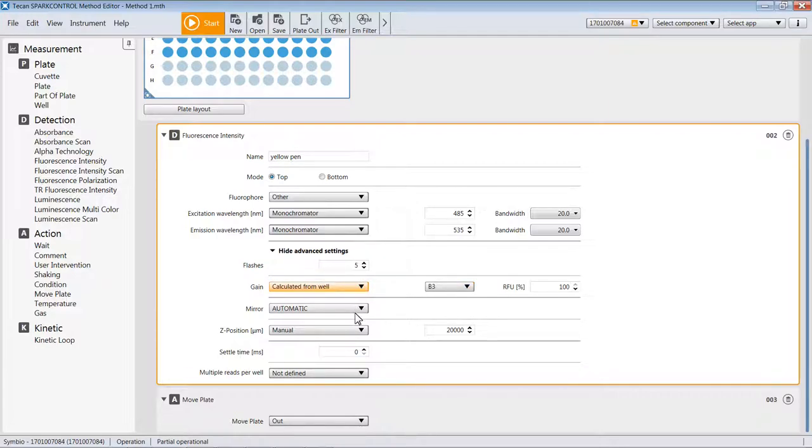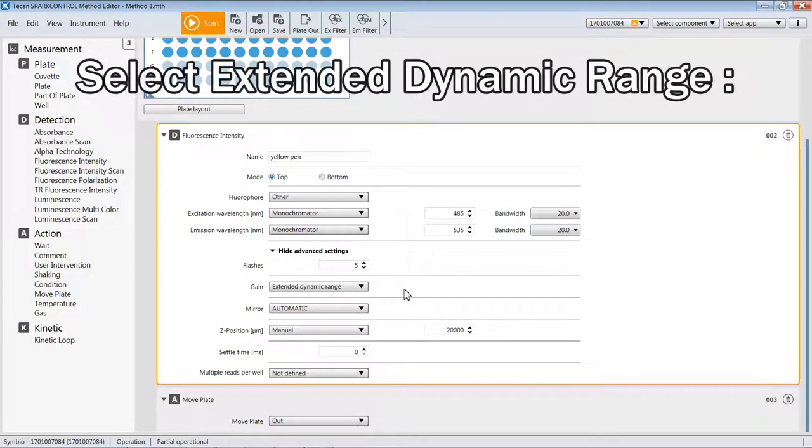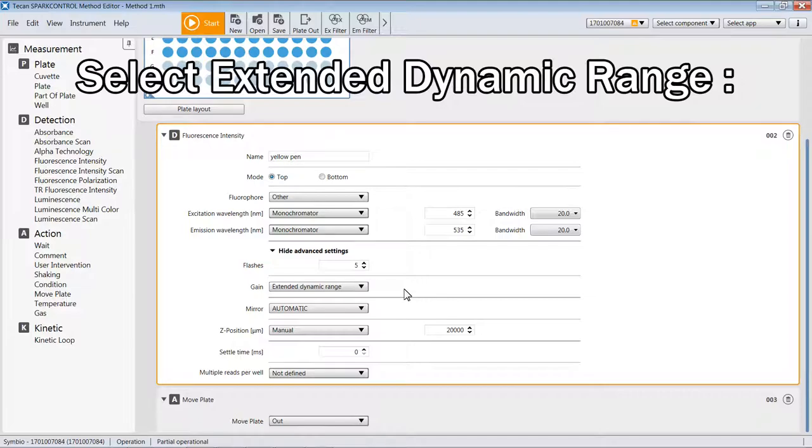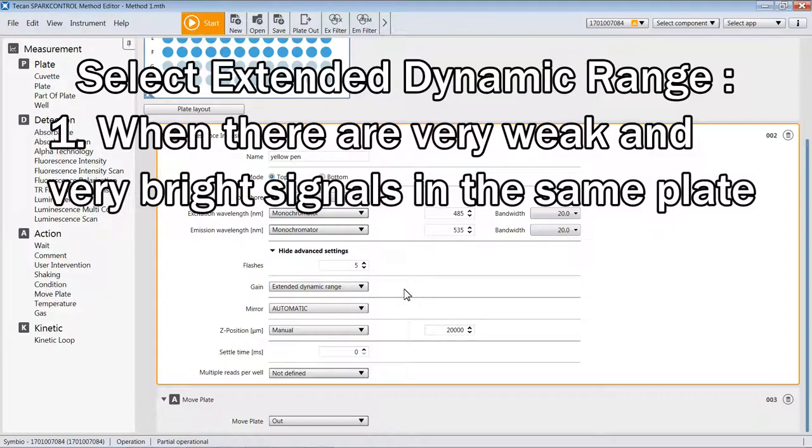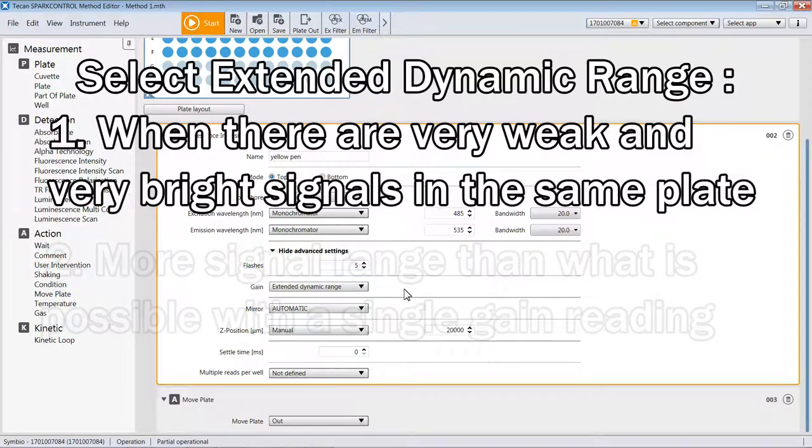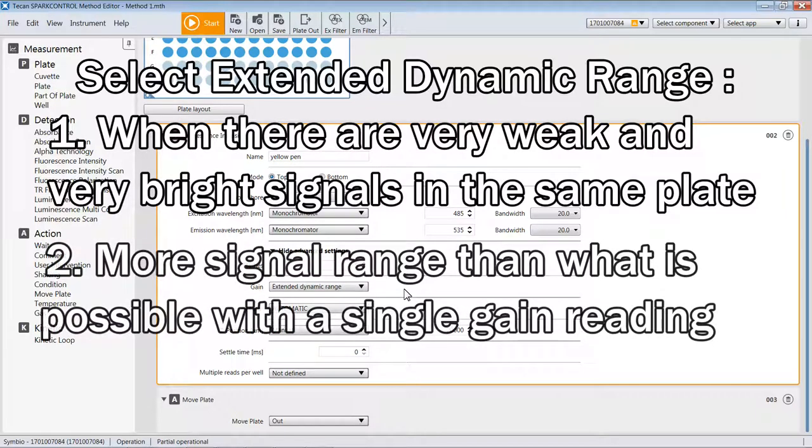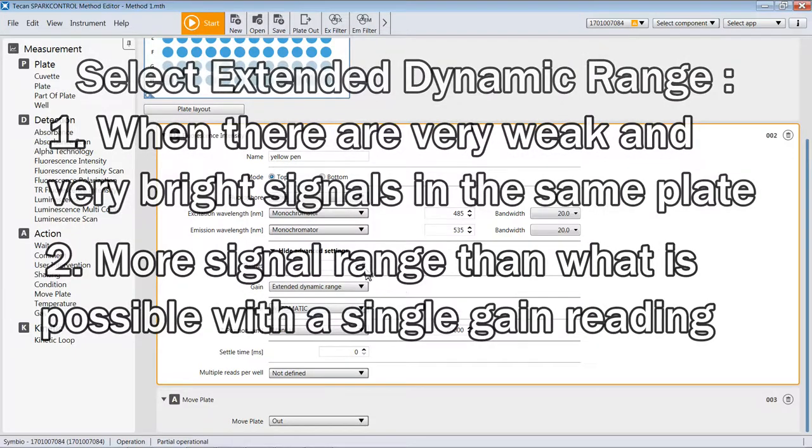There is a third means of determining gains called extended dynamic range. This is a way for the reader to use two separate gains to measure the samples, and by virtue of this, it can give you a much broader range of signal intensities from 0 to 6.5 million. You would use this feature if you know that you've got very weak samples in your plate mixed in with some very bright samples, but it is a way of being able to get more range out of the instrument than you otherwise could by just measuring at one gain.